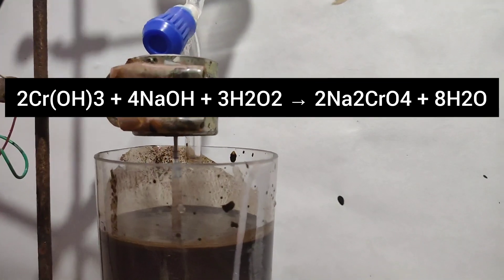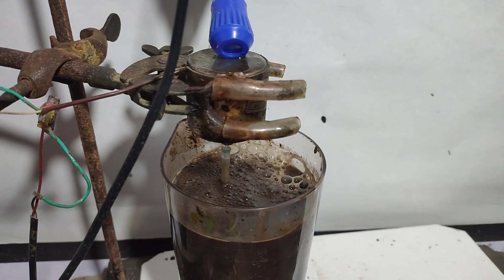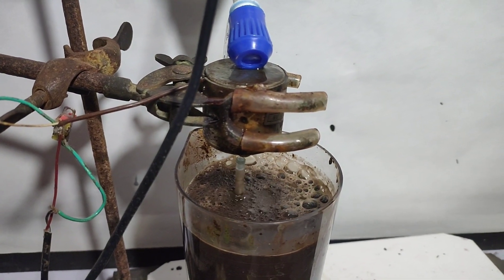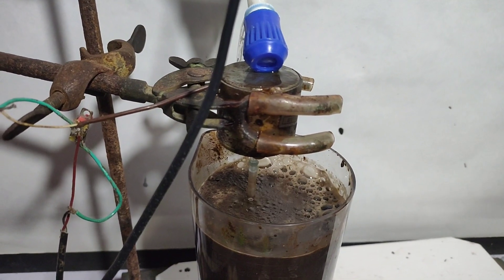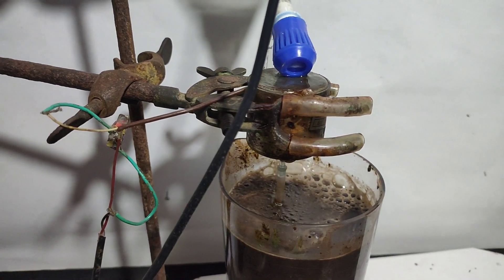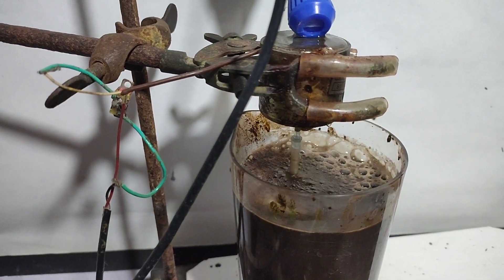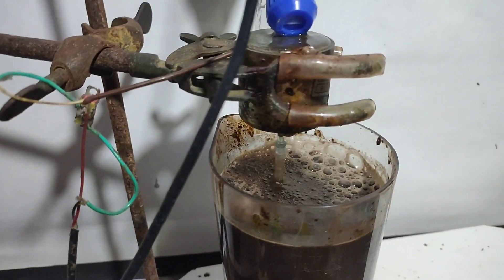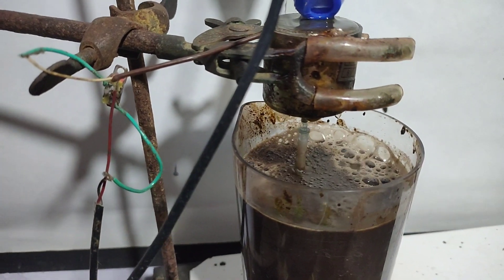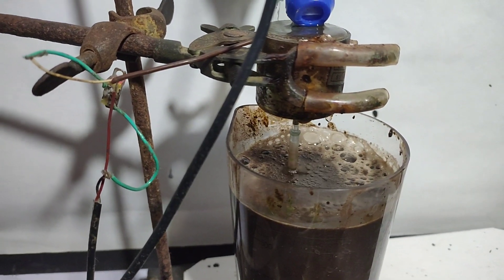The volume became large so I transferred the solution into a larger beaker. After adding 300 ml hydrogen peroxide, on further addition vigorous foaming started taking place, so I thought reaction was over and all the chromium hydroxide would have been converted to sodium chromate.